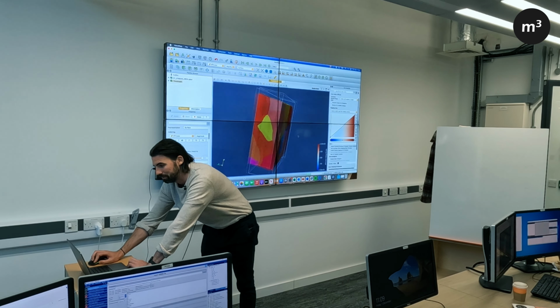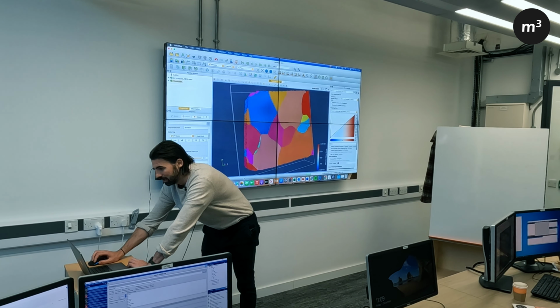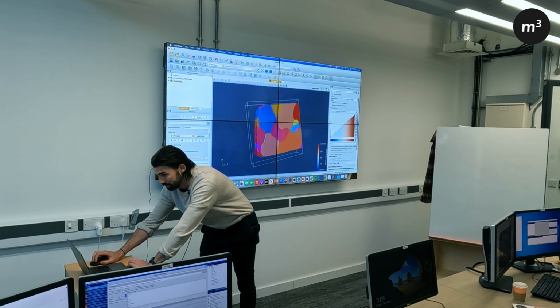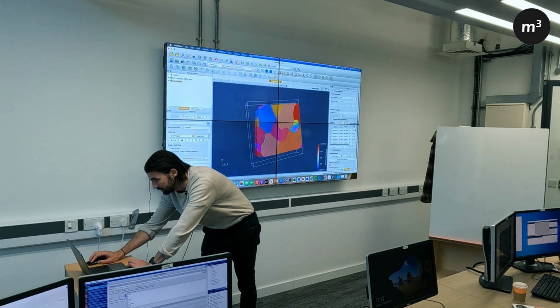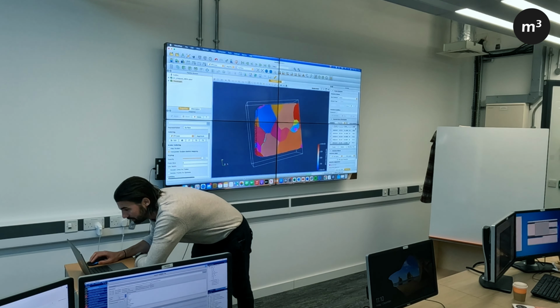If we want to pick out a grain from the 3D volume, so we want to have a look at this blue guy here, there's this feature here, you can select points. Is it this one? Select points on. Click that. Drag a box here and it'll select those cells there. And then we can use this find data filter here. Is it there? This one. Find data, and that will show all those cells you've selected. It will tell you all the detail you have for them, including, crucially, the feature ID. Oh no, that's points. Sorry, not points, you want cells. Select cells, that's the one.